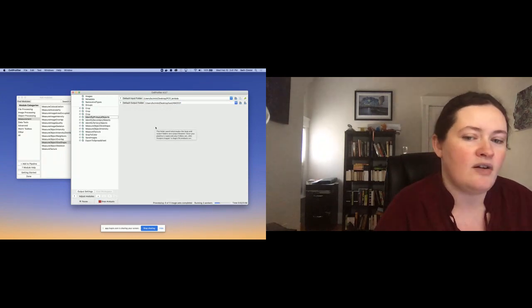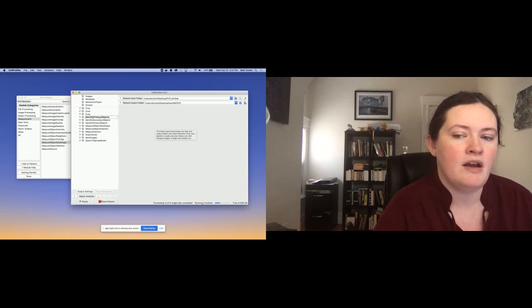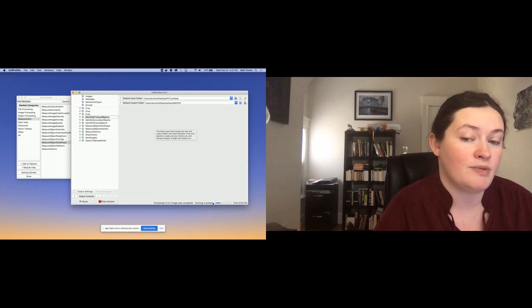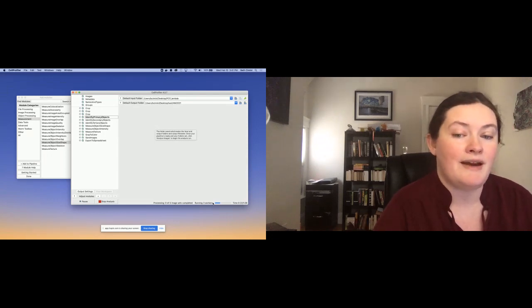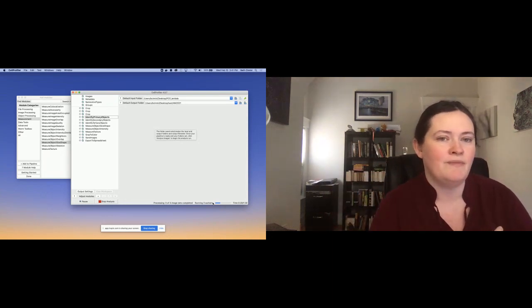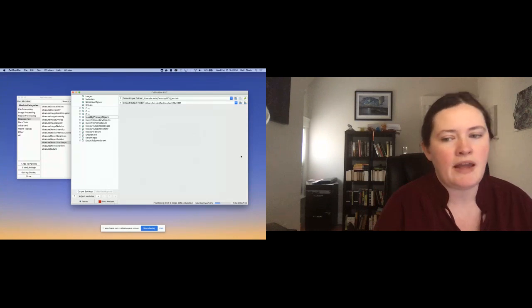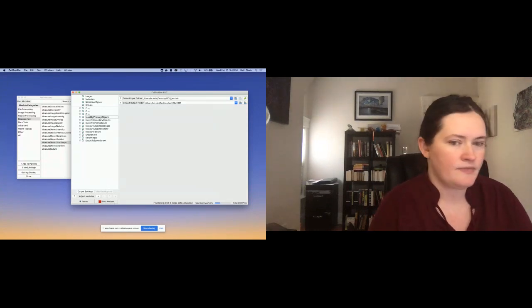This is going to analyze all of the image sets that I have. In this case, it's 3. If I had more than 3, it would analyze as many as I had loaded in. It's running 3 CPUs at a time because there are only 3 images, but it's going to default to running as many CPUs at a time as you have on your computer. You can tell it to use less if you want, but that means if you have 1,000 images to run and you have a 16 CPU machine, for example, it's not going to run 1,000 images on one CPU. Each one is going to run 60, and so it's going to complete a lot faster. And this should only take a minute or so to run.